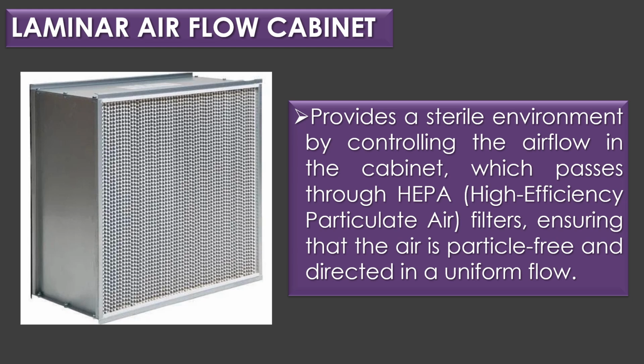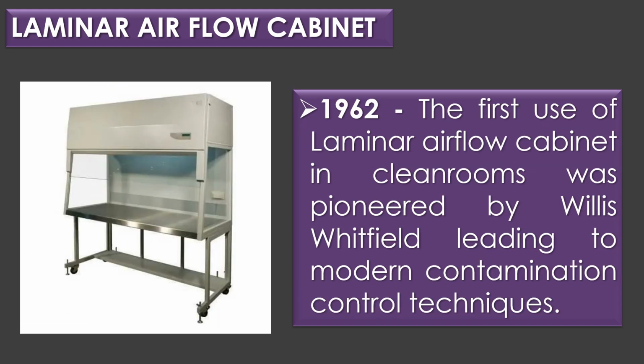Laminar airflow cabinet provides a sterile environment by controlling the airflow in the cabinet, which passes through HEPA filter or high-efficiency particulate filters, ensuring that the air is particle-free and directed in a uniform flow. The first use of laminar airflow in clean rooms was pioneered by Willis Whitfield in 1962, leading to modern contamination control techniques.